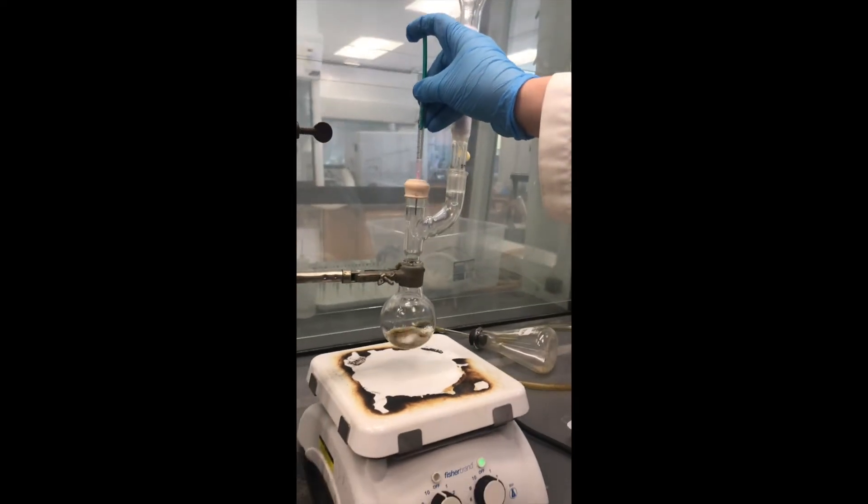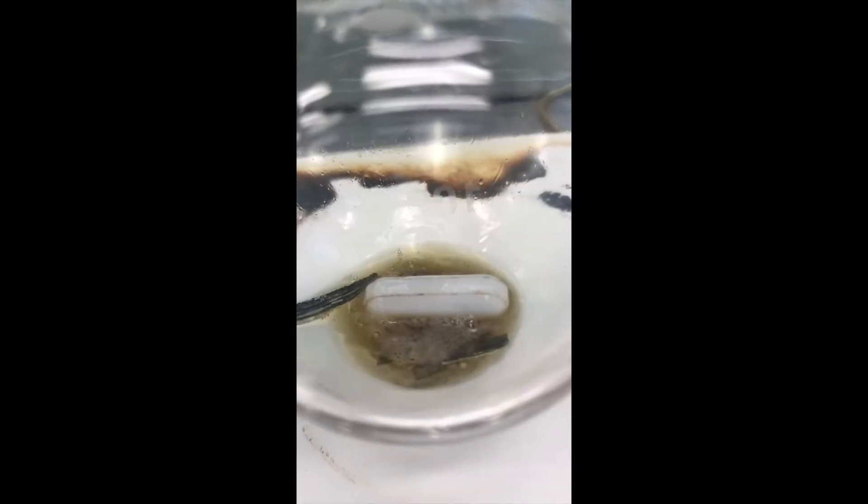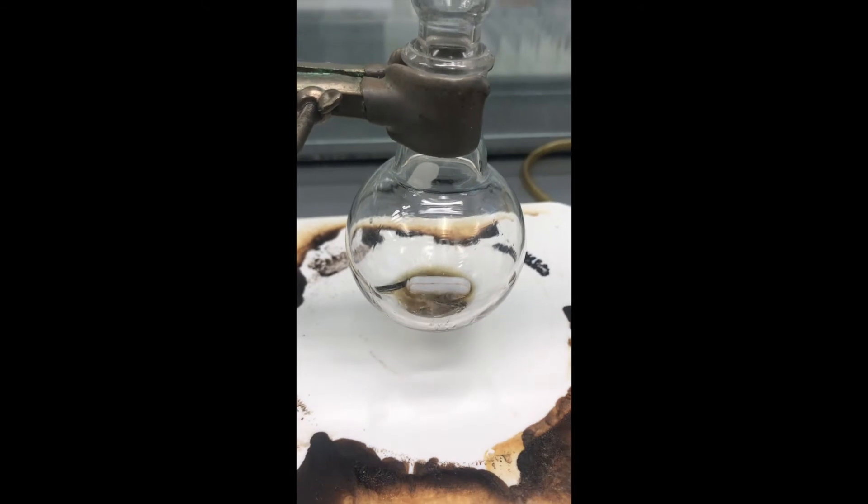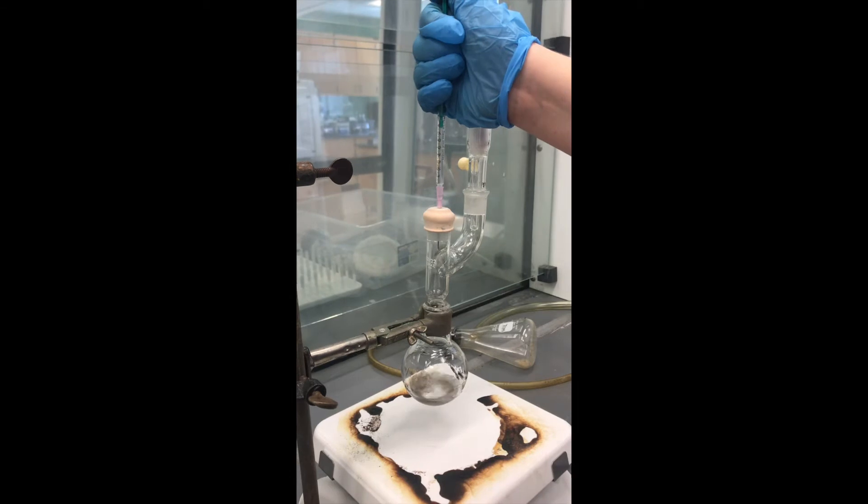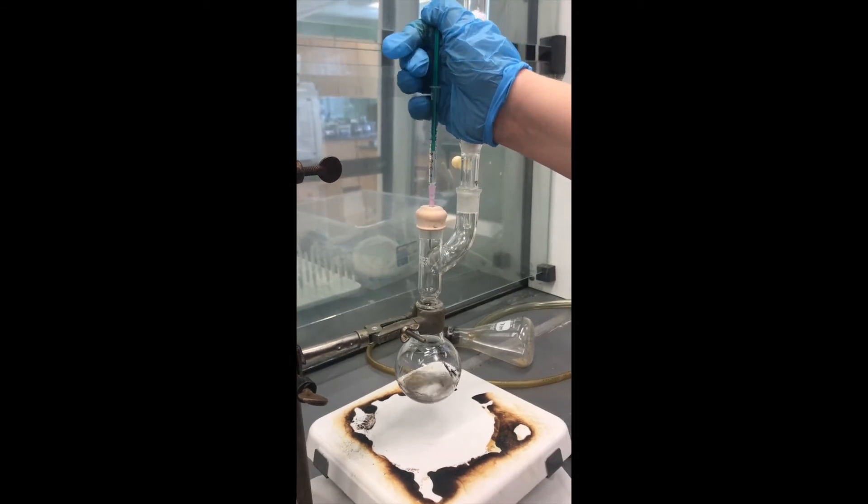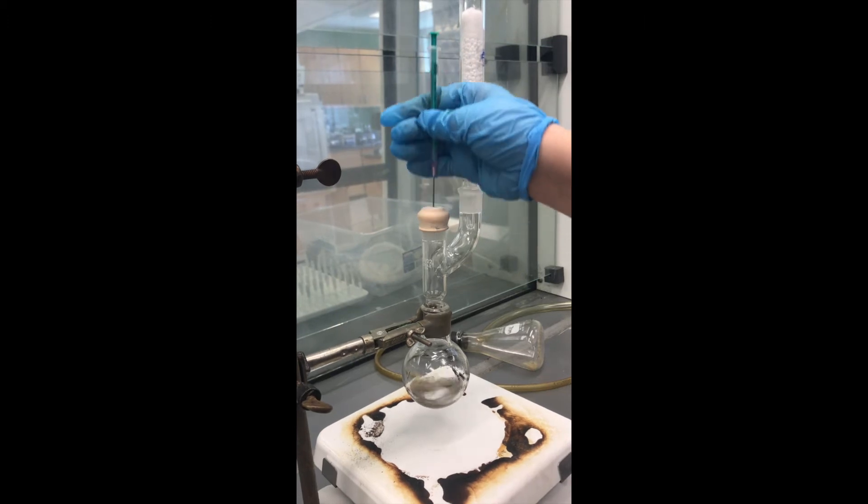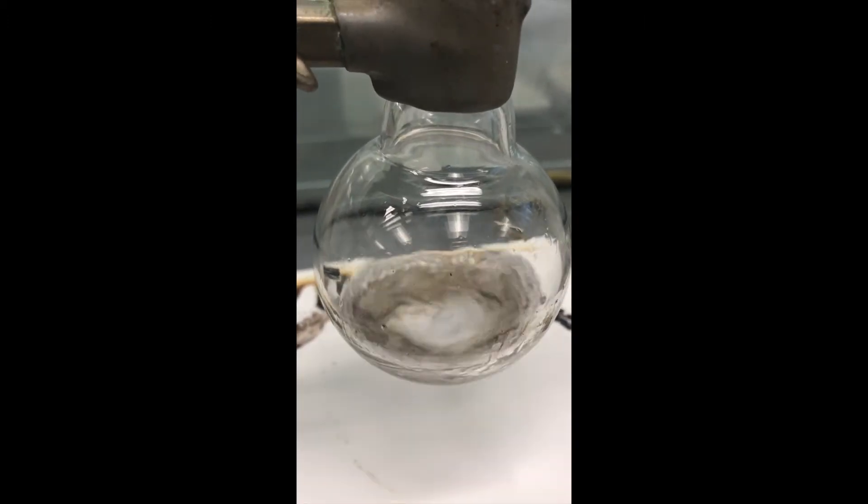Over the next 15 minutes, I added the rest of the bromobenzene solution. I rinsed out my vial with anhydrous ether and added that to the reaction as well. At times, I had to gently heat the reaction to keep it going. And I did end up adding a little bit of anhydrous ether to make sure my volume was remaining constant. For the next 15 minutes, I monitored the reaction and watched as the magnesium was being used up.